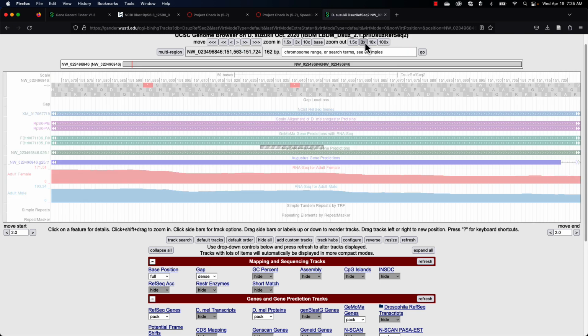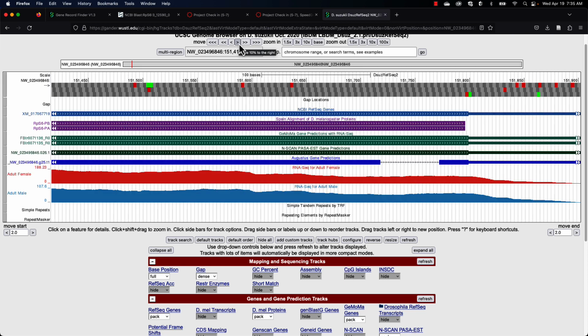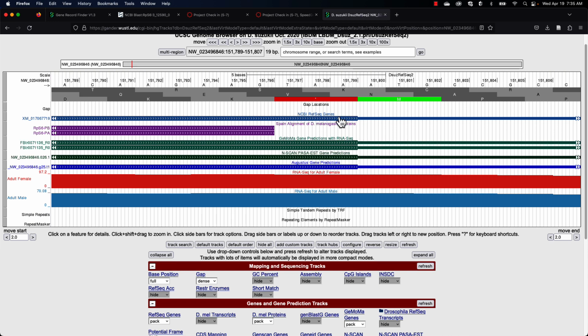Boy, maybe I will zoom out because it's taking forever. Okay, so then we go to the back end of the gene, and again, in frame 3, excuse me, we have our stop codon. So here's what you have to put down. The gene ends at this nucleotide, 151,796, and then the stop codon is 797 to 799. That's not part of the gene, it's the stop codon. So you have to do that same process for the 3 coding sequences of the PB form too.